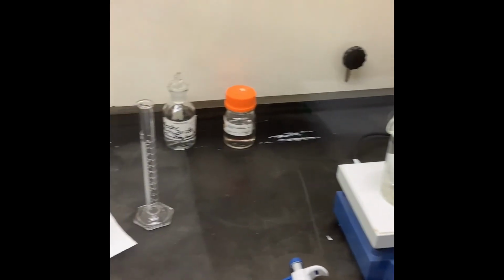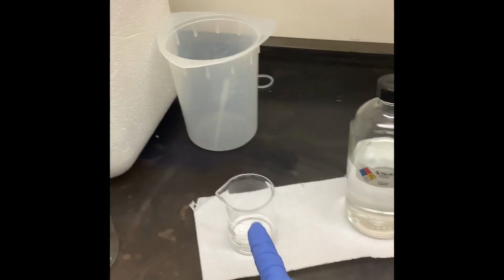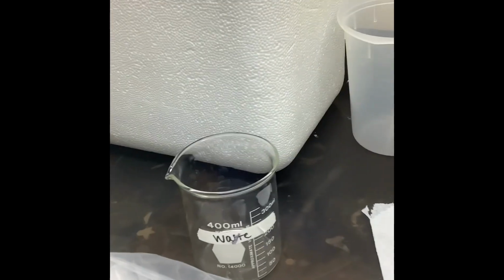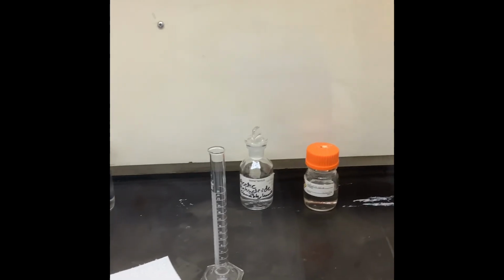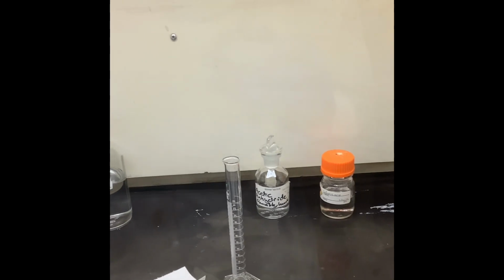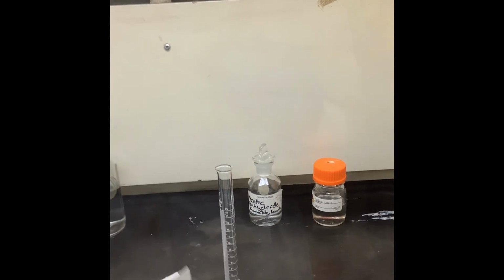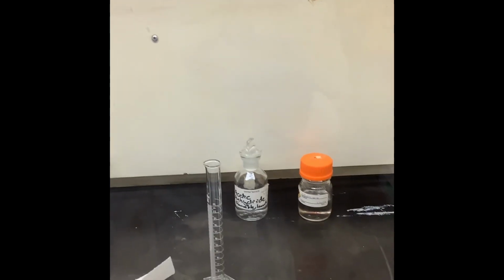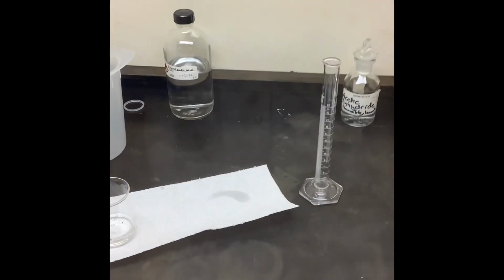So here's what the hood looks like, all set up with all my chemicals and running. You'll see that I have my glacial acetic acid poured into this little beaker, and then the bigger bottle can be moved back out of the way. You want to keep glacial acetic acid and the other two chemicals separate, and you want to be extra careful with acetic anhydride and the concentrated sulfuric acid. I always have them pushed against the wall so that they're not in danger of being tipped over. Sulfuric acid especially can lead to some very serious acid burns, so be very cautious when you have that bottle open and you're using that chemical.